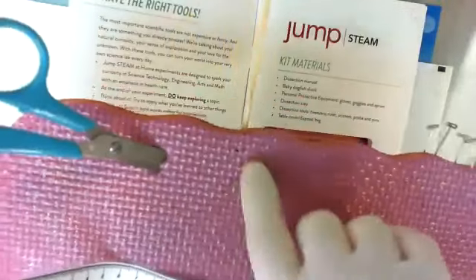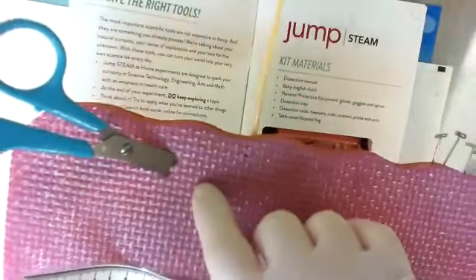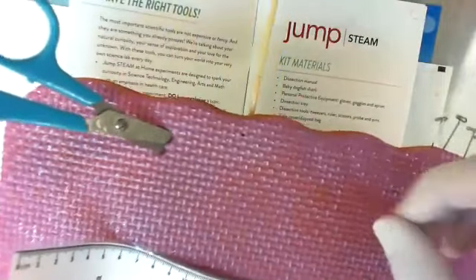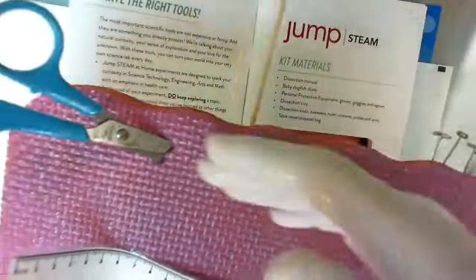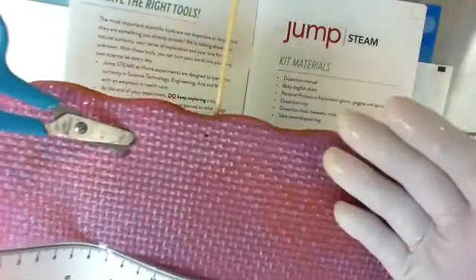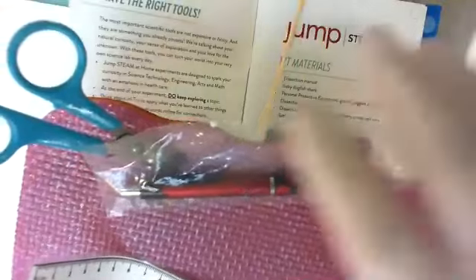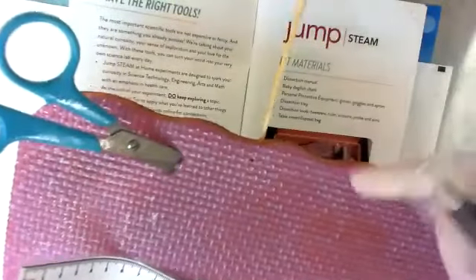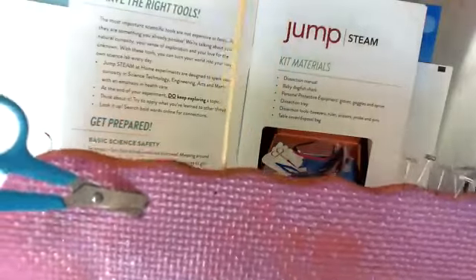It drives me crazy when med students or residents, which are new doctors, or the surgeons come in here and they're using needles or suture needles or injectable needles or a scalpel, and they just leave it on the table, because someone else could come along and put something on top of it where they couldn't see it, and then they go to grab a pen and they cut themselves on a scalpel. Always know where your sharps are. Always know how many you have and keep track of them.